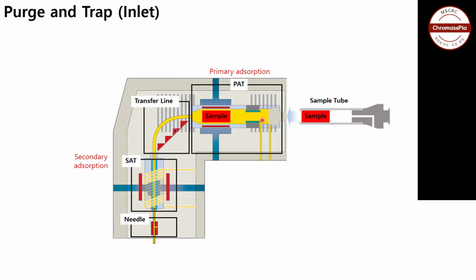So we first put in a little amount of sample, and if you cannot get meaningful data, you increase the amount of sample. Understand? Yes, thank you.